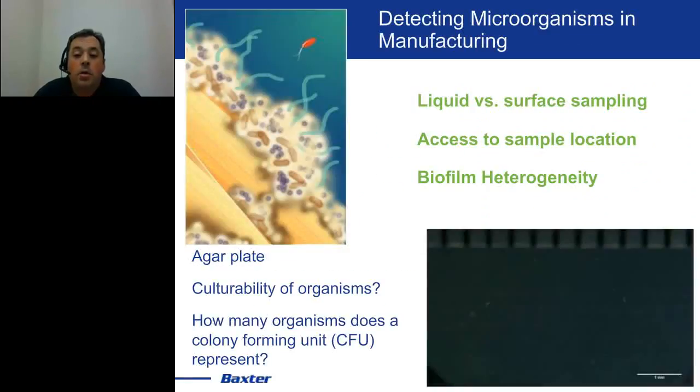All right, so when you're thinking about detection of microorganisms in a manufacturing setting, the first thing you need to think about is where you're going to do your sampling. Hopefully this is based around your microbial control plan. You're going to be thinking about, okay, what kind of sample am I taking? Typically, we take a liquid sample. There are occasions where we might take a surface sample, usually a swab. Did we pick the right location? If we are taking a surface sample, how accessible is the location we'd like to get to? We might be swabbing the tank, but the real issue might be in a valve upstream, because biofilms are very heterogeneous. They don't necessarily occur consistently across your system.